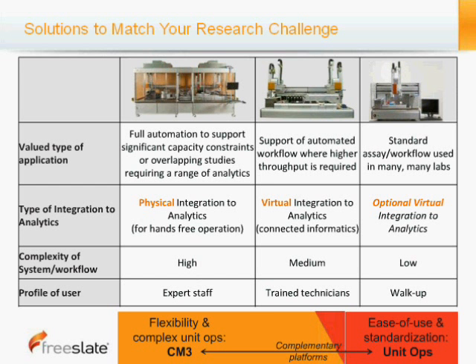And so typically the configured system is just a slight modification of that standard system that we have. And so those really are developed to support automated workflows where higher throughput is required. Typically, instead of having integrated analytics, they'll have virtual integration analytics. The complexity of the workflow is medium. And typically those systems are operated by trained scientists and technicians.